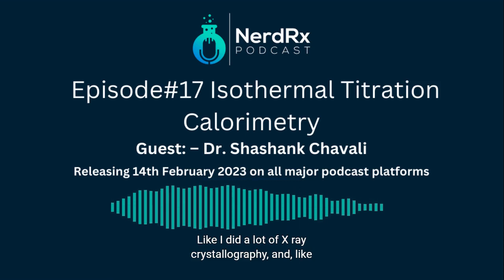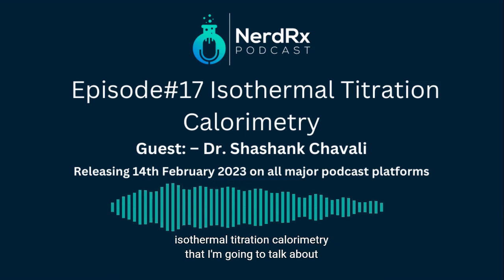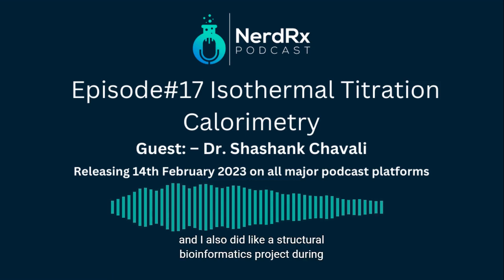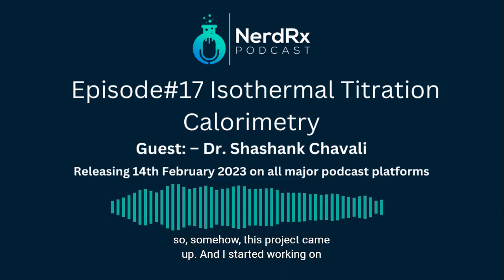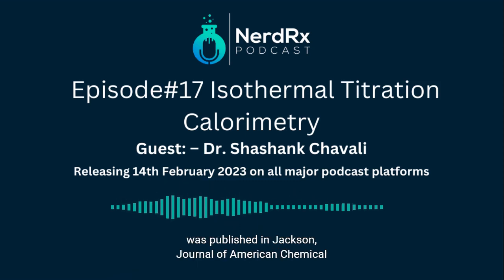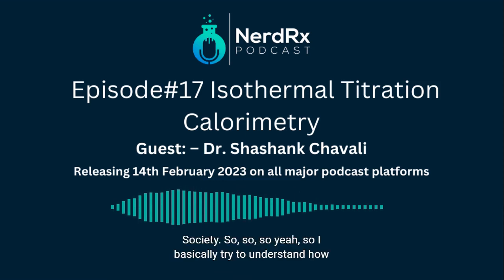I did a lot of X-ray crystallography and isothermal titration calorimetry that I'm going to talk about, and other binding experiments such as surface plasmon resonance. I also did a structural bioinformatics project during COVID because we were not allowed to go into the labs. Somehow this project came up, and I started working on that, and that led to a very interesting finding, which was published in JACS, the Journal of the American Chemical Society.